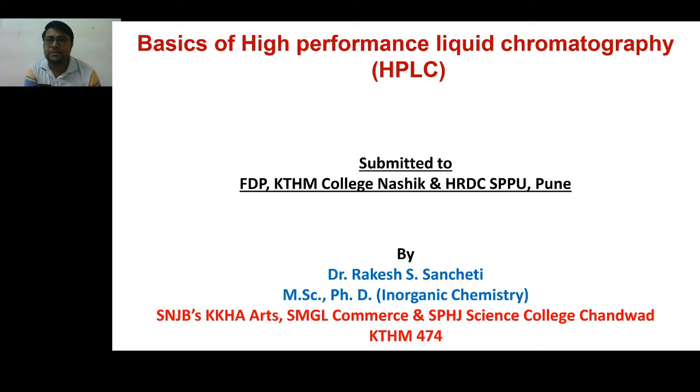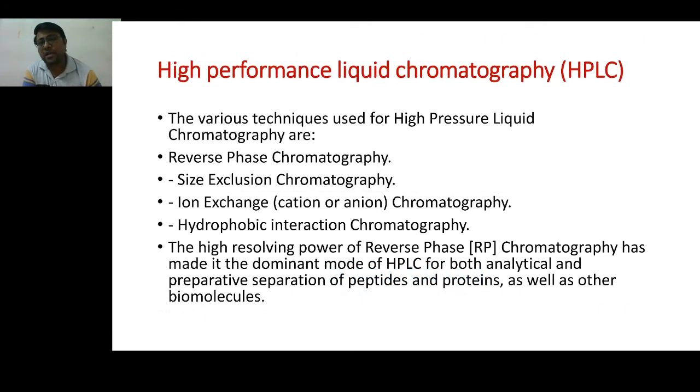All these techniques have a basic principle: the detection, identification, and purification of components. Chemical components or drugs having impurities can be isolated, detected or purified using chromatographic techniques.